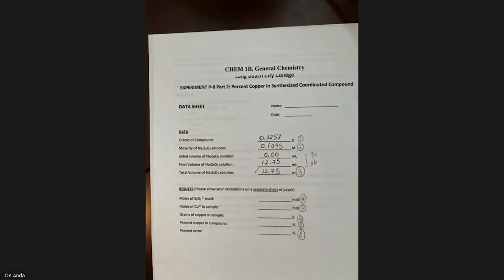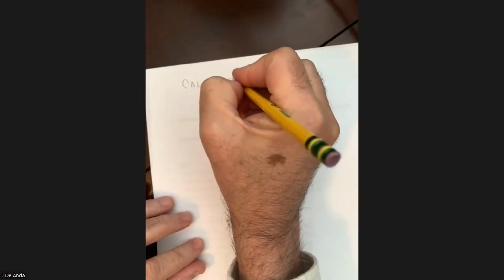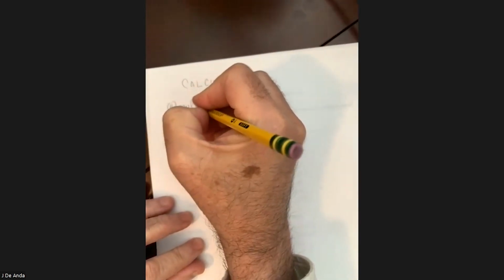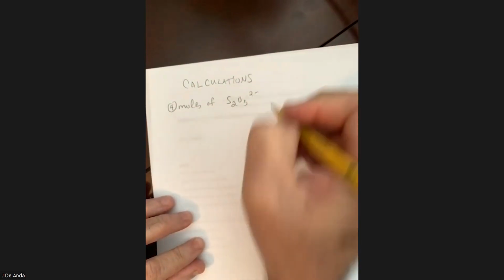First of all, we're going to calculate the number of moles used. And I usually suggest, don't try to cram your calculations in here. Just take a separate piece of paper, and let's call this simply calculations. The first thing we're going to calculate here is the moles of thiosulfate that we employed. Let me see if I can move this around so we can see everything in place. There you go.